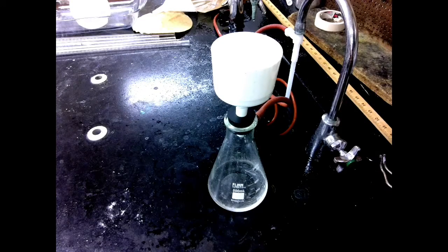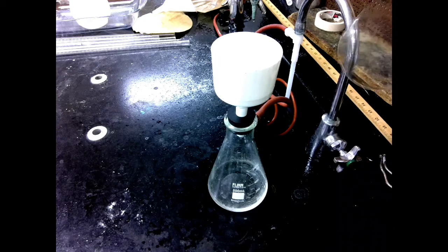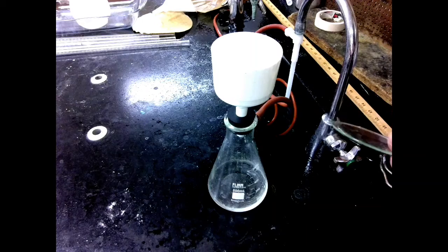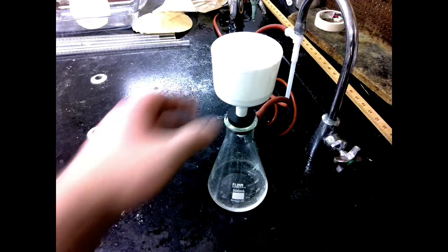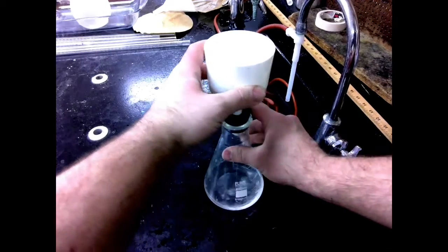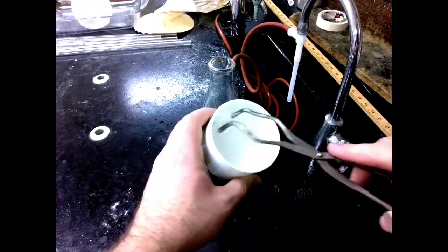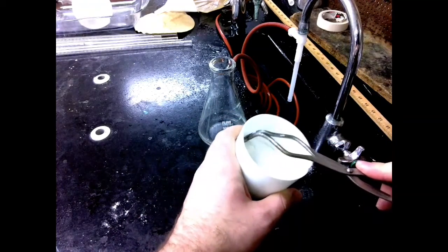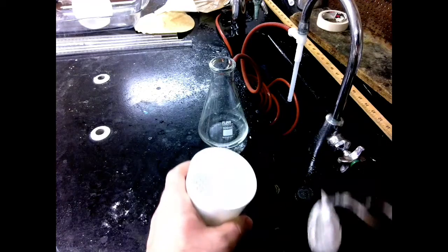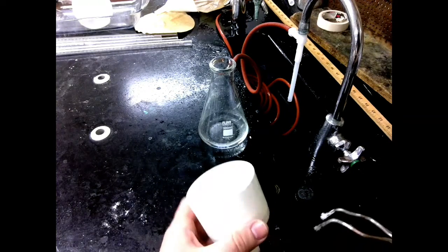So now the final thing I need to do is just take this out of the Buchner funnel. I'm going to put it on a watch glass. I'm going to put it in the drying oven overnight, and then I can weigh it for my final weight. So take my Buchner funnel off. I'm just going to take some tongs. I'm just going to use that to grab the filter, lift it gently out, and place it on my watch glass.